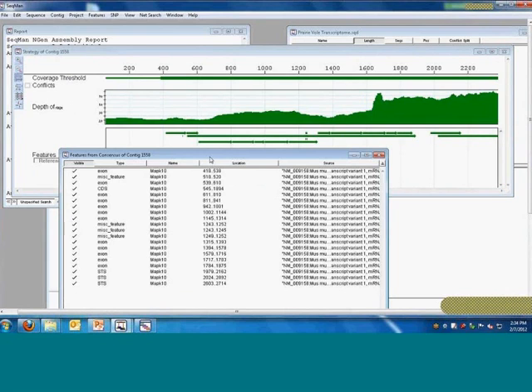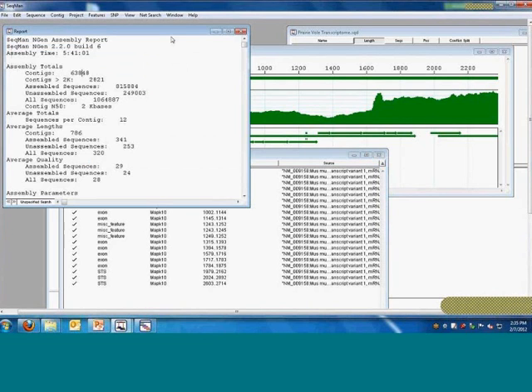And so the same kind of tools we can use with the de novo genome, with a de novo transcriptome analysis, can be very beneficial. And from some of the earlier speakers today, it's very useful to have this transcriptome data along with the genome data. You can use transcript data to verify the accuracy of genomic contig assemblies. And there's a very good idea that I've heard a couple times recently, the possibility of taking an assembled de novo transcript and mapping it back to a genome assembly to try to use the exons to scaffold gene sequences together. And that's something that I'd like to discuss with some of the developers and see what the possibilities are there.